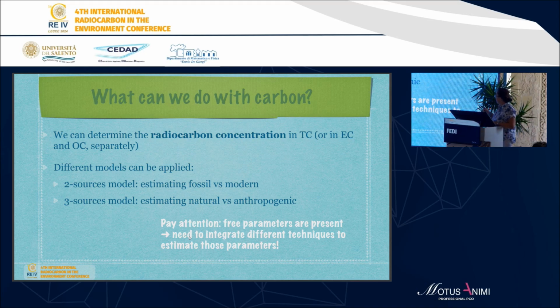Of course, it depends on our technology, and also on what we are interested in, because we can use a simple two sources model measuring the total carbon, and in this way we can estimate fossil versus modern contributions, or we can measure EC and OC, and apply a three sources model, and in this way we can estimate the natural versus anthropogenic sources.